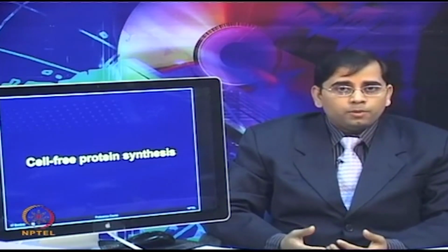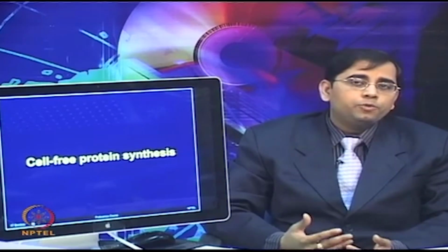To eliminate all those problems, people have started using the cell-free protein synthesis method. Cell-free synthesis systems make use of template DNA in the form of plasmids or PCR products for direct in vitro protein synthesis in the presence of a crude cell lysate, which contains all the necessary machinery required for transcription and translation, with essential amino acids, nucleotides, salts and other energy generating factors added exogenously.